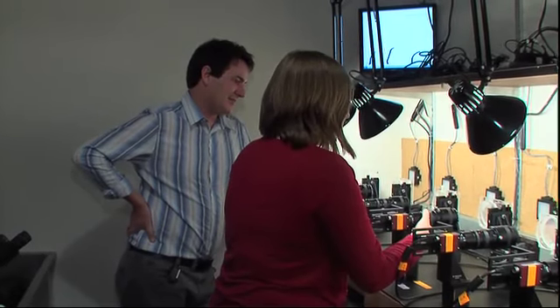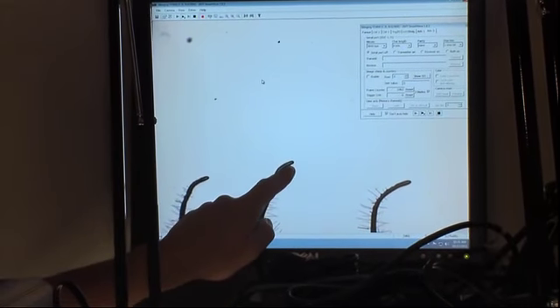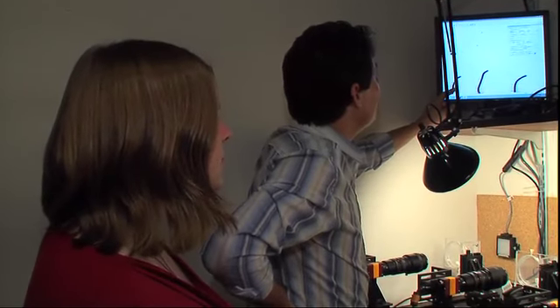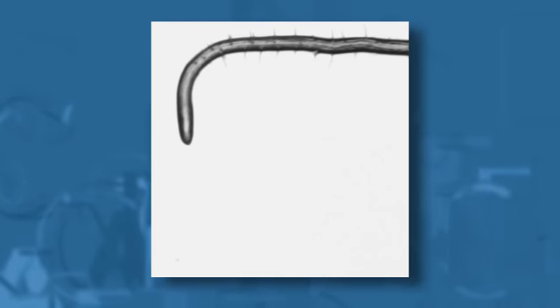We can't hope to improve a plant unless we understand it well. With support from the National Science Foundation, plant physiologist Edgar Spalding wants to know what makes plants tick. He says the key is to study the function of each of the thousands of genes that make up their DNA. One way to do that is to collect images of plants that have those genes altered in some way.